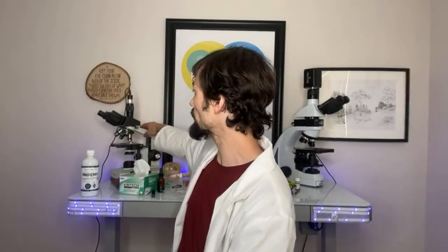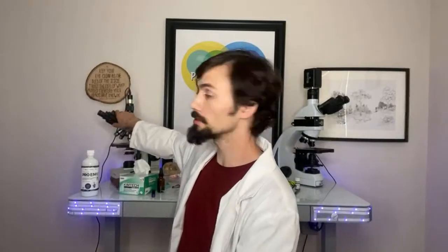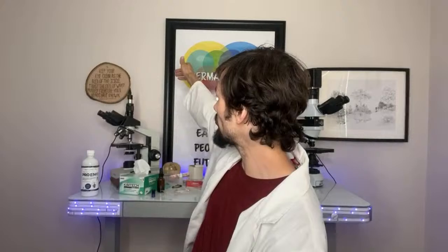Today we are talking about which microscope do you need, because this is the most common question I get — 'Matt, I have a microscope, is this the right one? What should I buy?' This is the number-one question. So let's go through it. This is the brightfield basic — a compound microscope with a trinocular, which means it has binocular eyepieces and a C-mount on top.